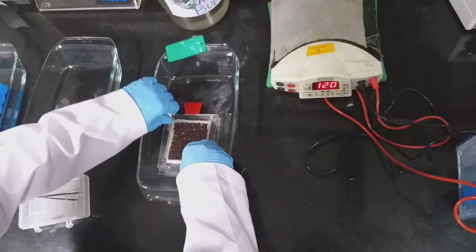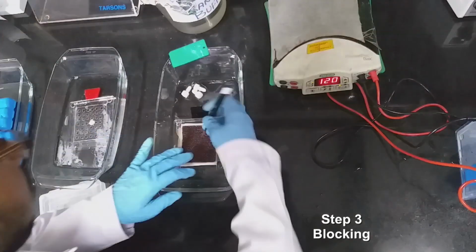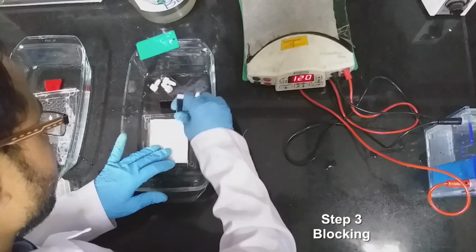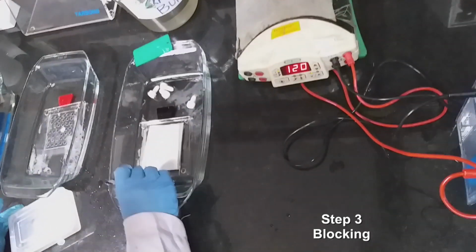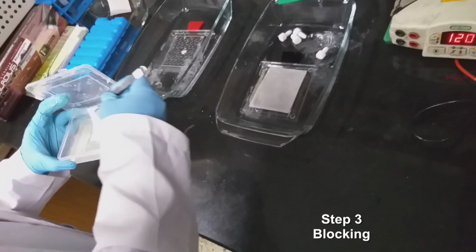Remove the screws properly. Gently remove the sponges. Take out the blot and keep it in blocking buffer.